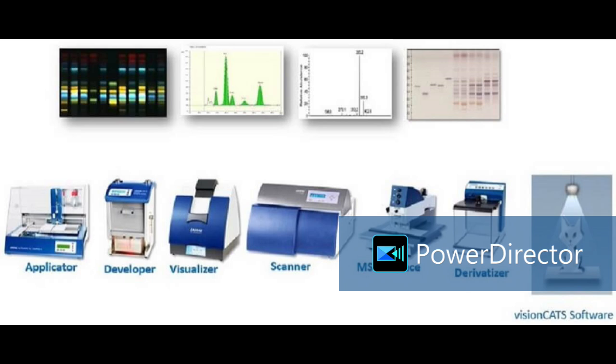Again it comes to the plate storage module, which is the processed module. So there are two terms, clean and processed. From the clean plate, your plate will go for application followed by development, and once both the steps are done it will come to the processed plates, and then with the help of the software you can remove that plate. So this is how robotic HPTLC works.